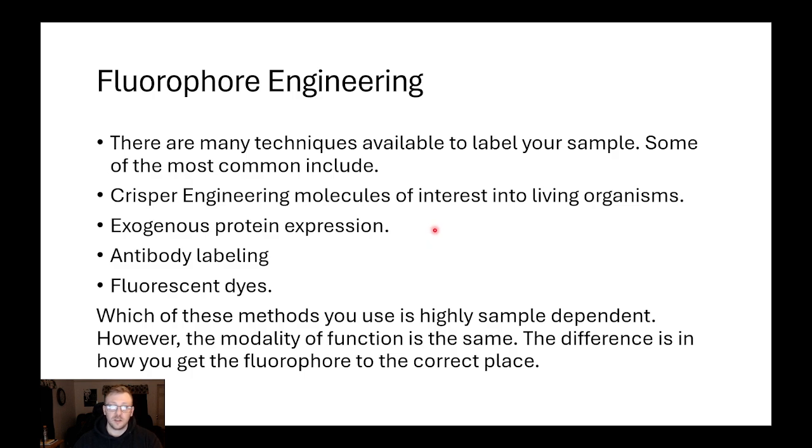We can do exogenous protein expression. Using a plasmid vector system, we can introduce an engineered protein design into some sort of bacteria and then purify out the protein, which we're going to go into detail on how you do as the second part of this video.